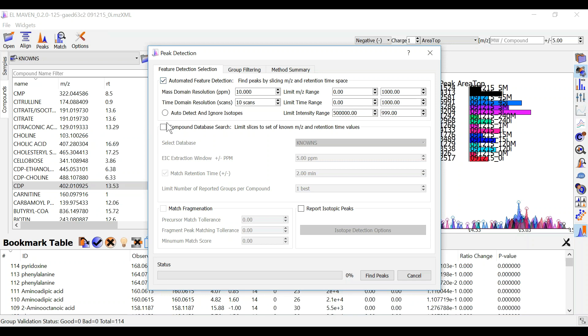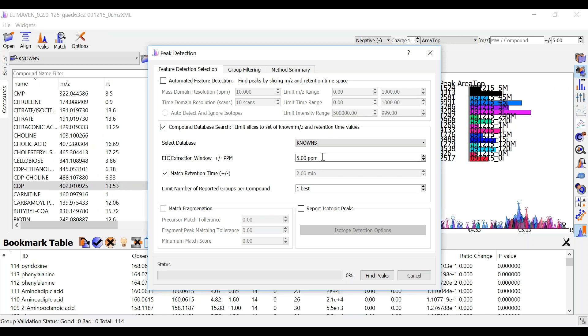For this demo I am going to perform a targeted peak detection. So ElmAven uses the RT information in the compound list to annotate my metabolites.